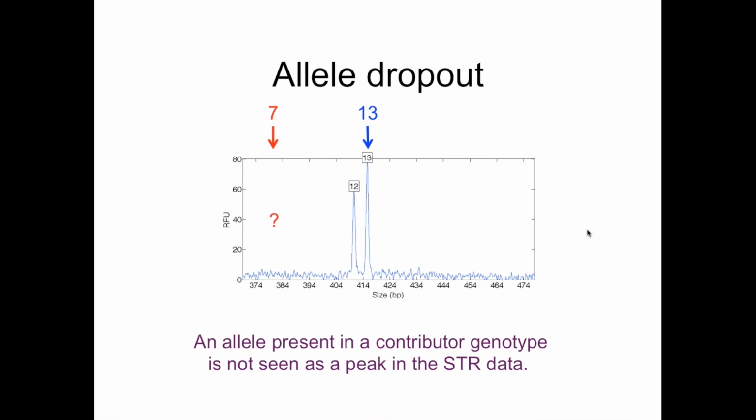Moving on to the second topic, let's take a look at allele dropout. So here's some data at a high molecular weight up in the 400s of DNA length, as seen by the axis in the electropherogram horizontally, with very low RFU values shown on the vertical y-axis.